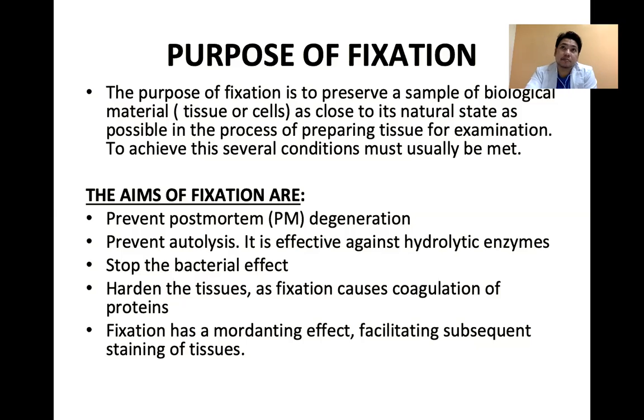So mordanting effect, class, is usually heard in staining, because a mordant is a bridge. It's a bridge, usually bridging the tissue to the stain. When it comes to fixation, class, it bridges the fixative to our tissues. Fixation bridges the tissue to other subsequent preparations or other histotechniques. So fixation has a mordanting effect. What's next? Clearing. Okay.